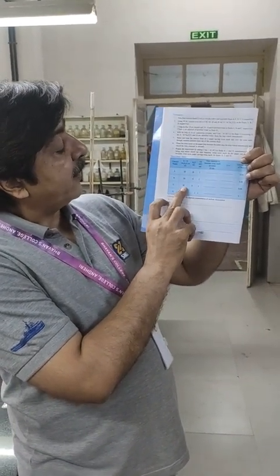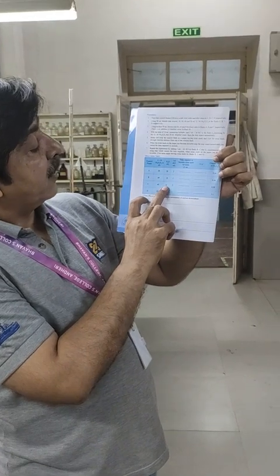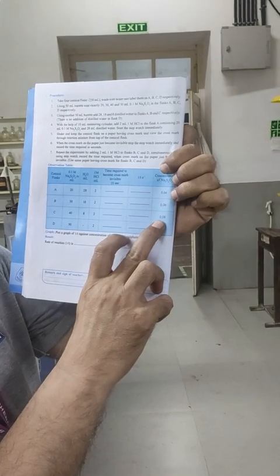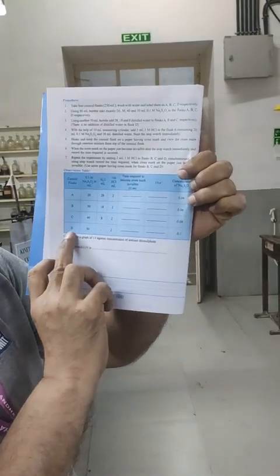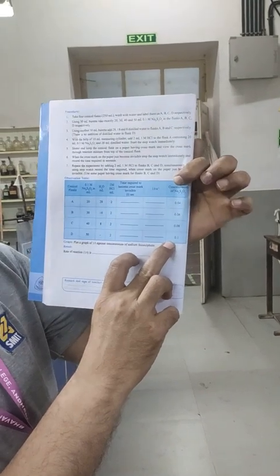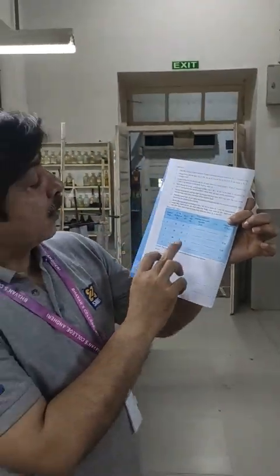Set C consists of 40 ml sodium thiosulfate, 8 ml of water and 2 ml of 1 molar HCl. Total volume again 50 ml. Resultant molarity is 0.08 molar. And in set D, the resultant molarity has been shown as 0.1 molar.